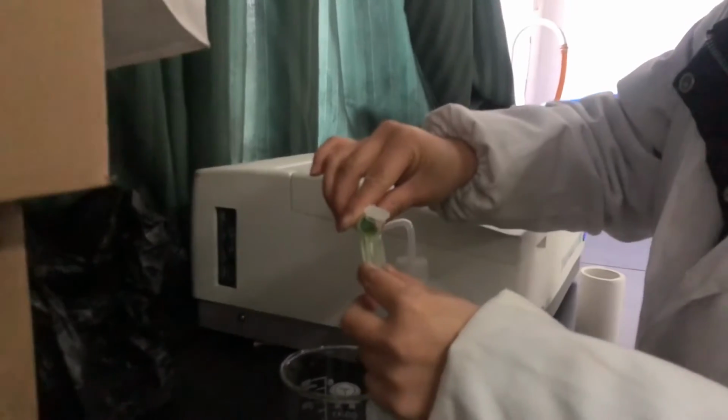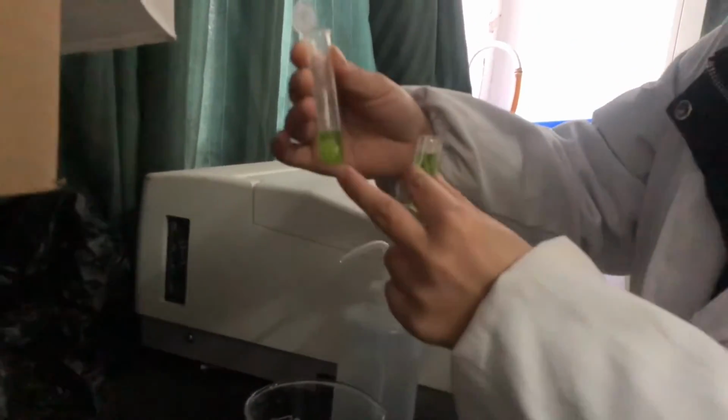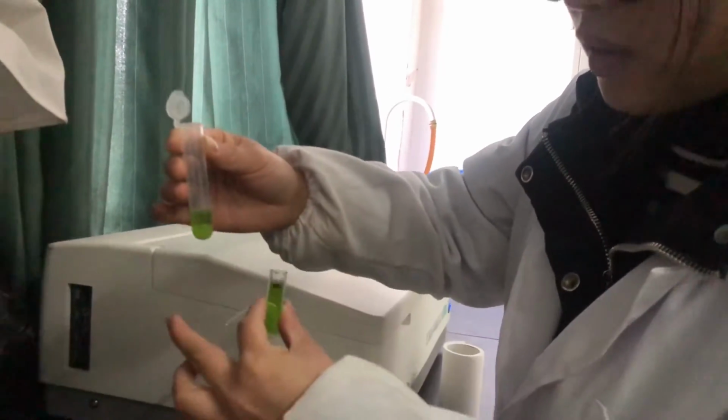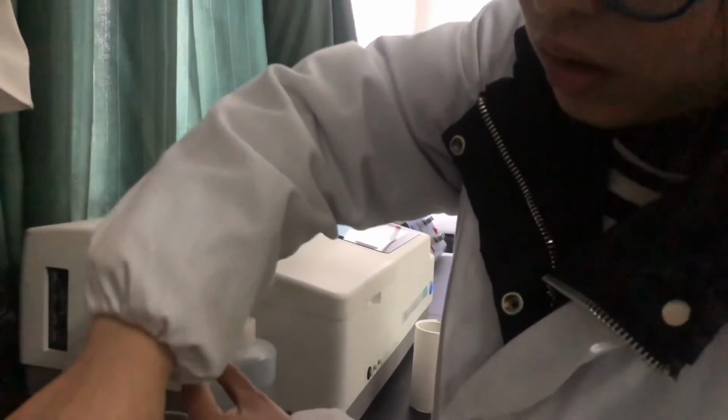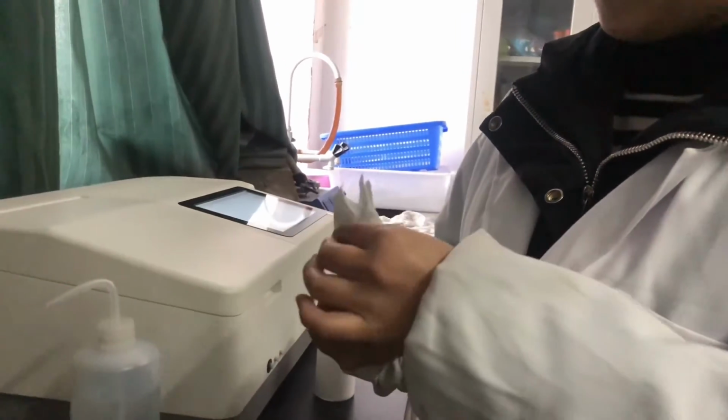Be careful. We should let the leaves down in this. Okay. Not pull out. And clean. Okay.